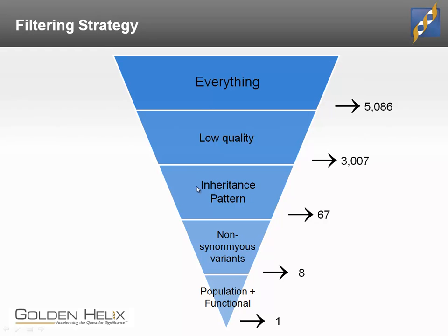And in fact, we're going to do a filter based on the family structure. But just yesterday, to see what it was like, I started with only the affected child. Again, because this is such a rare disease, we expect the variant to exist uniquely there. I started with just that child and got to a list of only 2 potential variants that matched the standard filtering techniques, without looking at any of the brothers or the cases or the controls or the mother and grandmother.